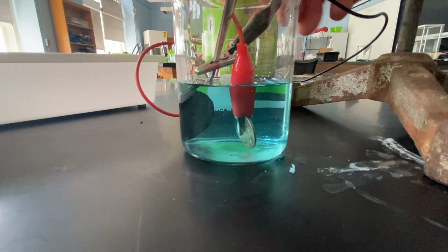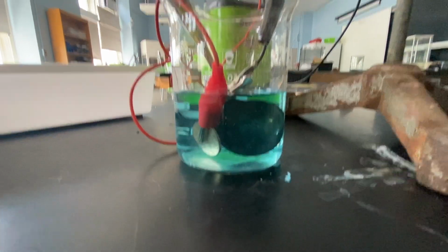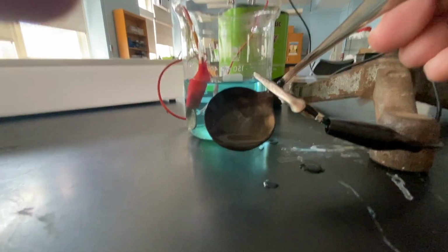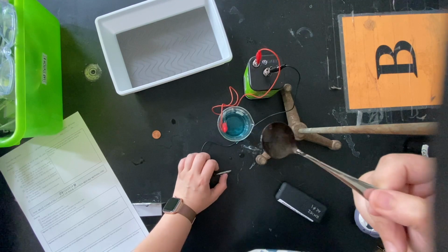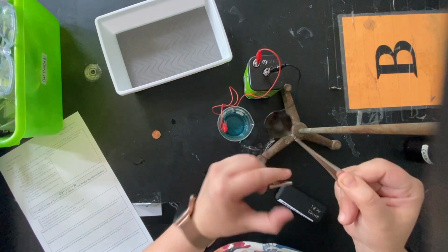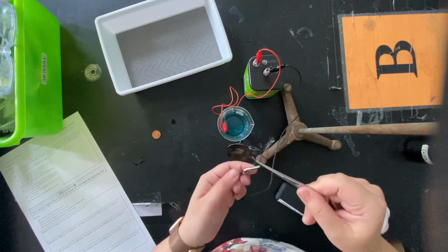If you're getting a bit impatient, you can lift up your spoon and check it out. And you can see we have some color changes to our spoon. You have some of that copper on it. And at this point, again, it doesn't take very long. You can stop. So again, you have with your spoon some of the copper coloring to it. You can let it sit a few more minutes if you want. But again, whatever was submerged in that liquid now is shined with a little bit of that copper.